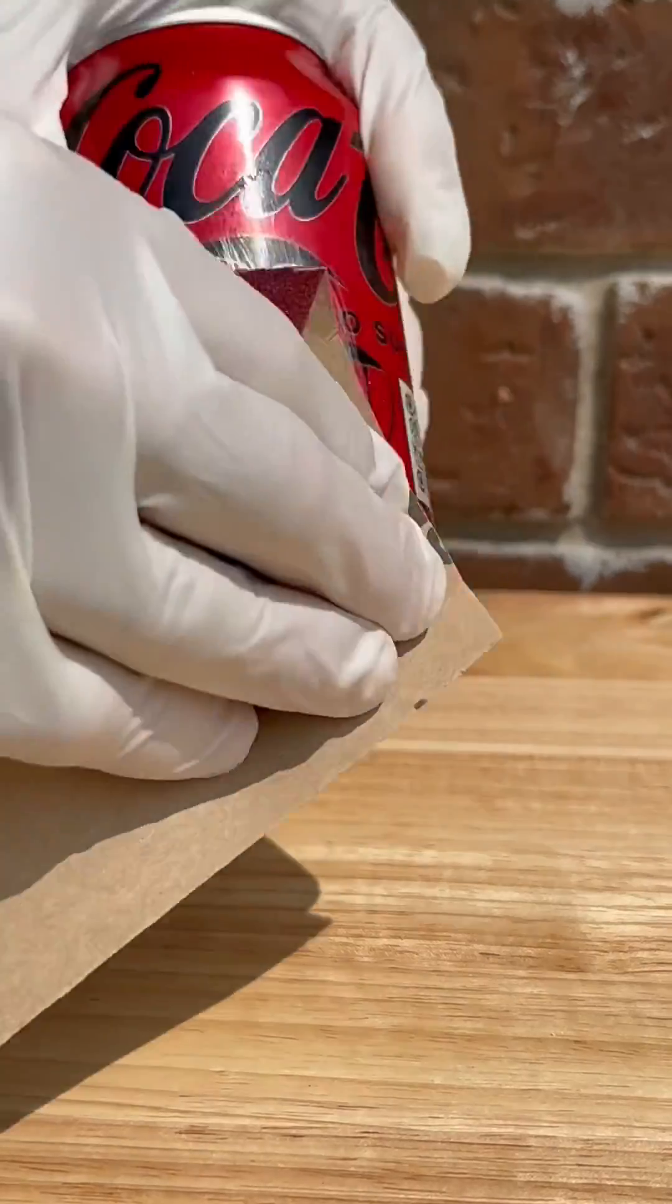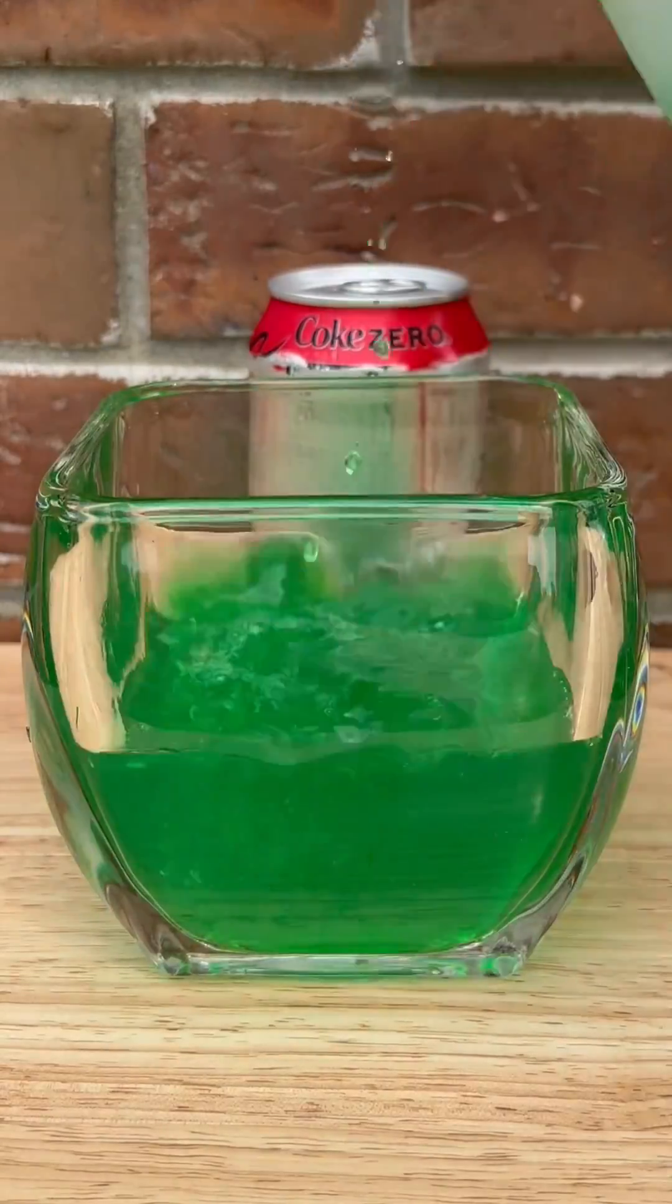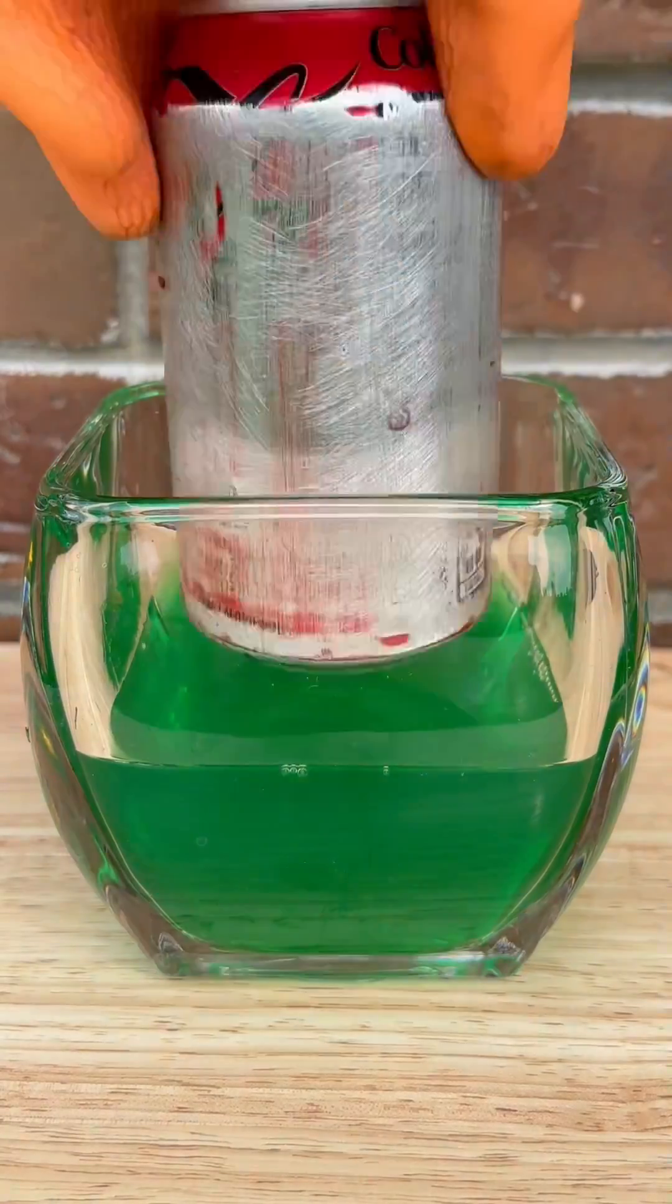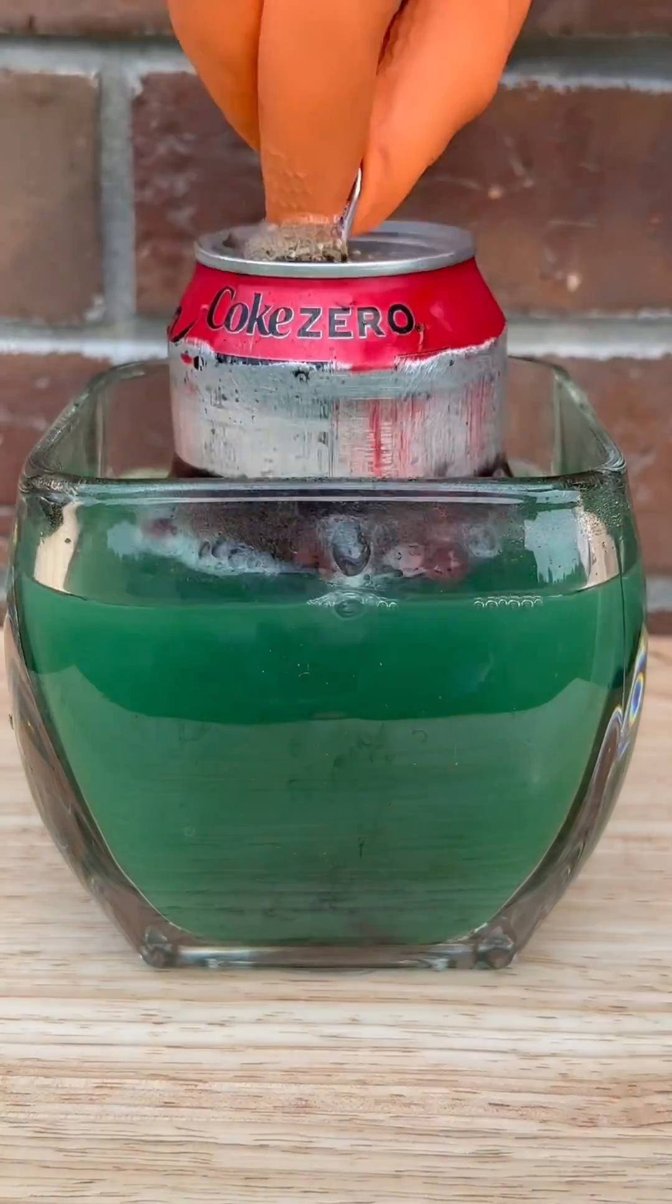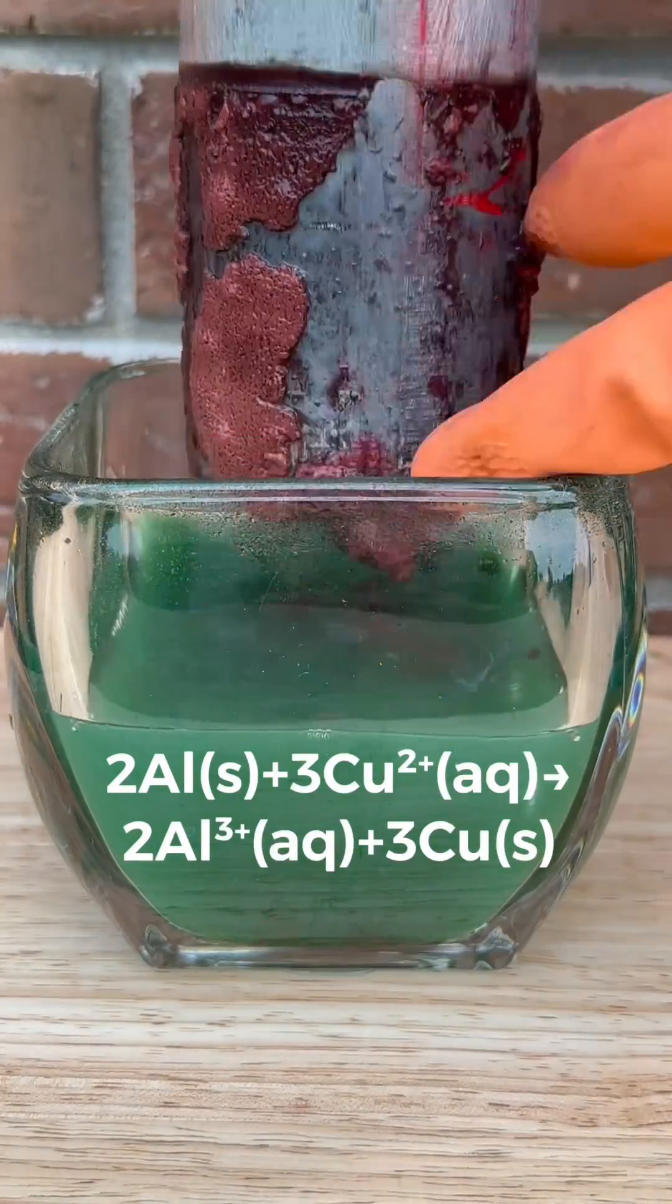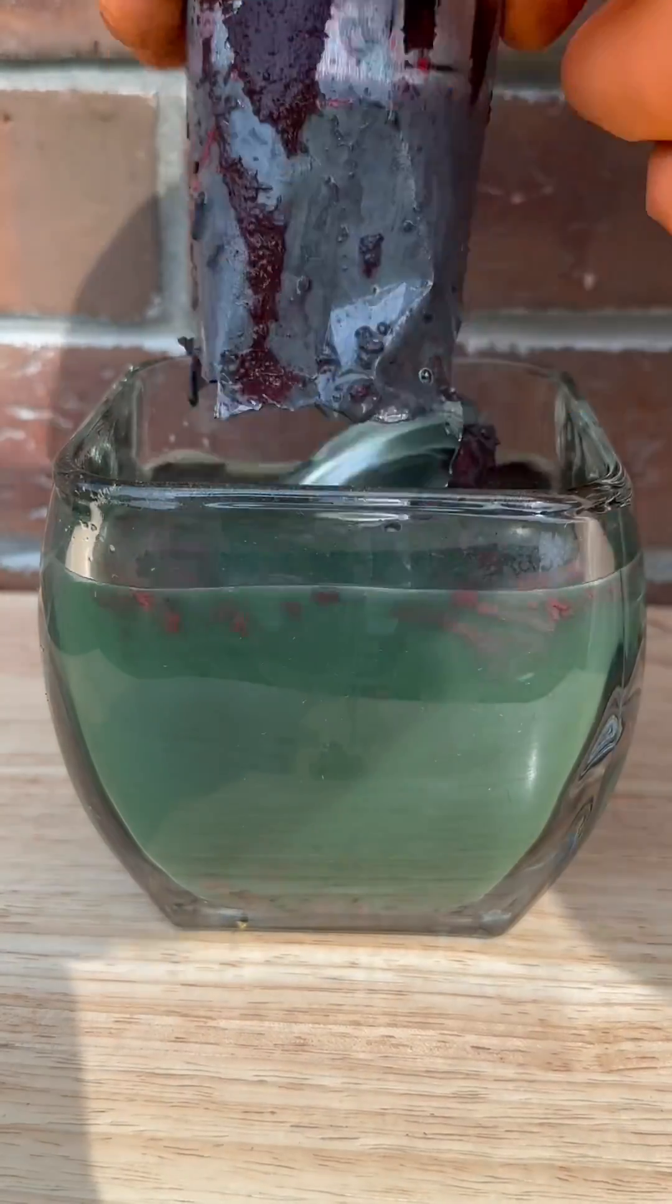I've also tried this experiment after sanding the paint off the can and also opening the can before placing it in the solution of copper. In this case, the results are a lot less messy. What I like about this particular method: you can see copper metal form on the outside of the can, and if you wait long enough, the copper solution will eat through the can.